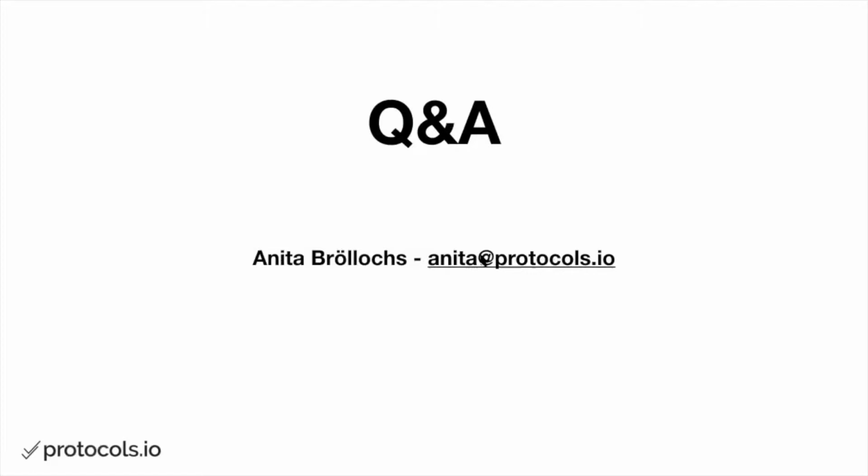So it is a good question. We don't mean to replace GitHub or Jupyter Notebooks. For the computational protocols, the intention is that protocols.io is more to capture the workflow so that you can say we ran the following script, and you would still link to GitHub.